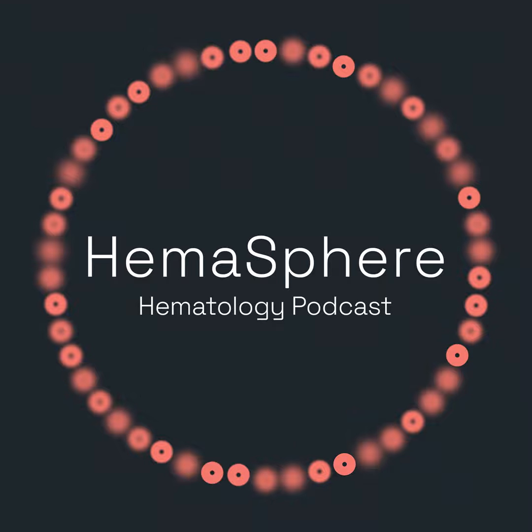Excellent. Traditional flow cytometry, and you also mentioned spectral flow cytometry, which is gaining more and more traction, which in a way also increases the complexity of the data because we've got way more immunophenotypic markers that we can add to the staining pool. And how will that influence the machine learning and, again, the computational approach to MRD? Is this going to be something which pushes the field even further forward, or what are your thoughts on spectral flow?